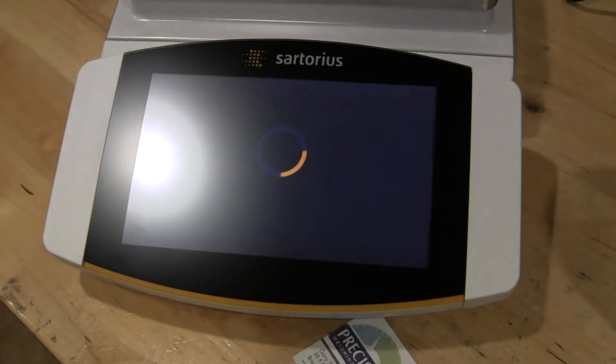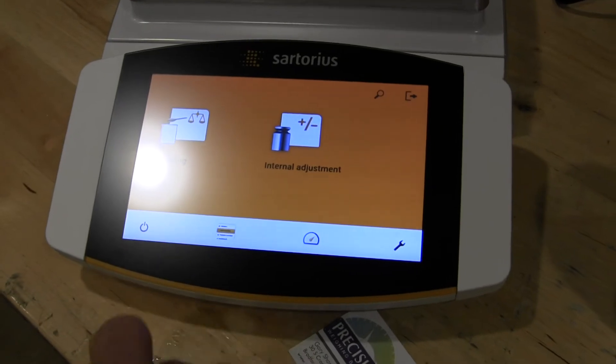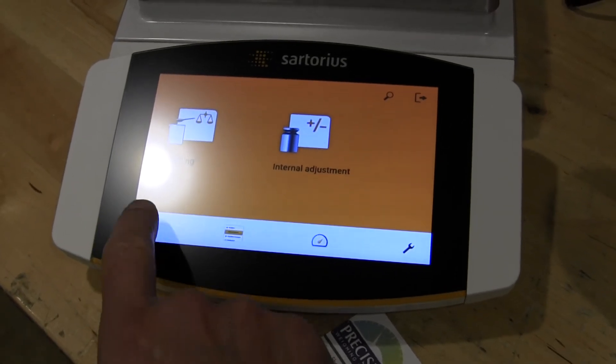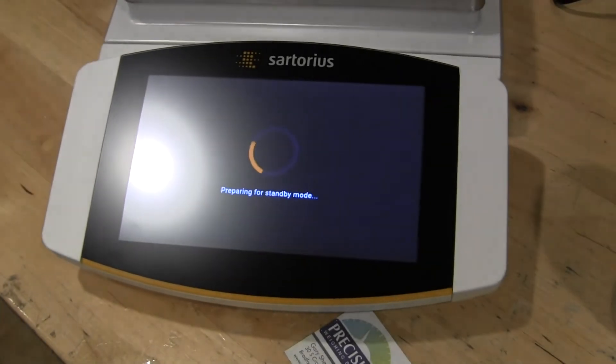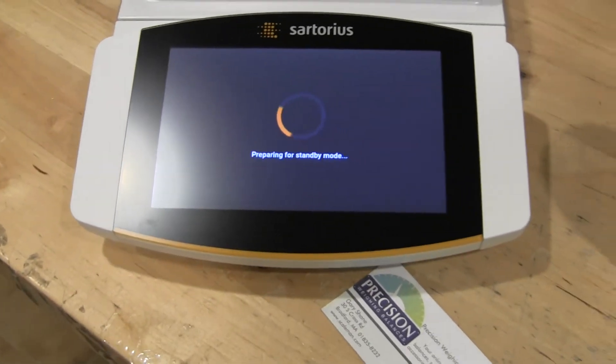Let me power down the balance. You'll notice with the touch screen it's just a simple touch of the button — you don't need to press hard. This is a touch screen throughout; just lightly tap.